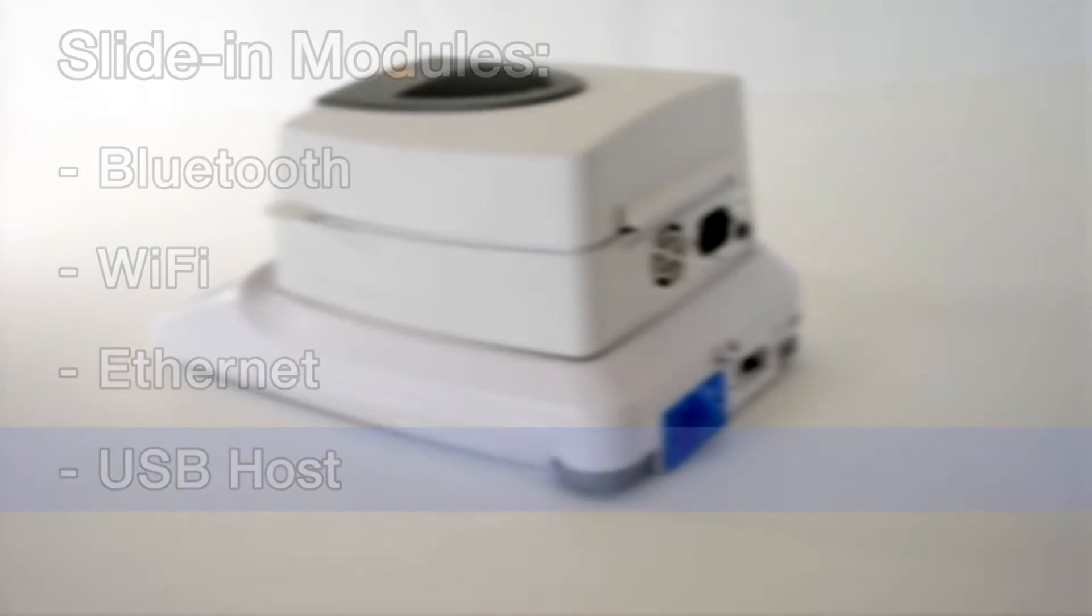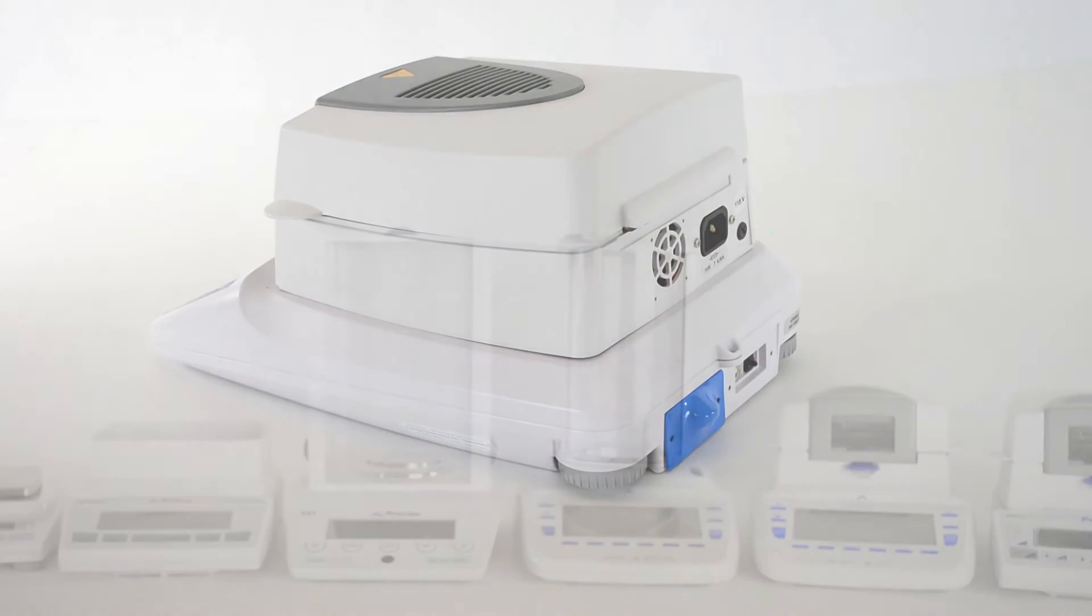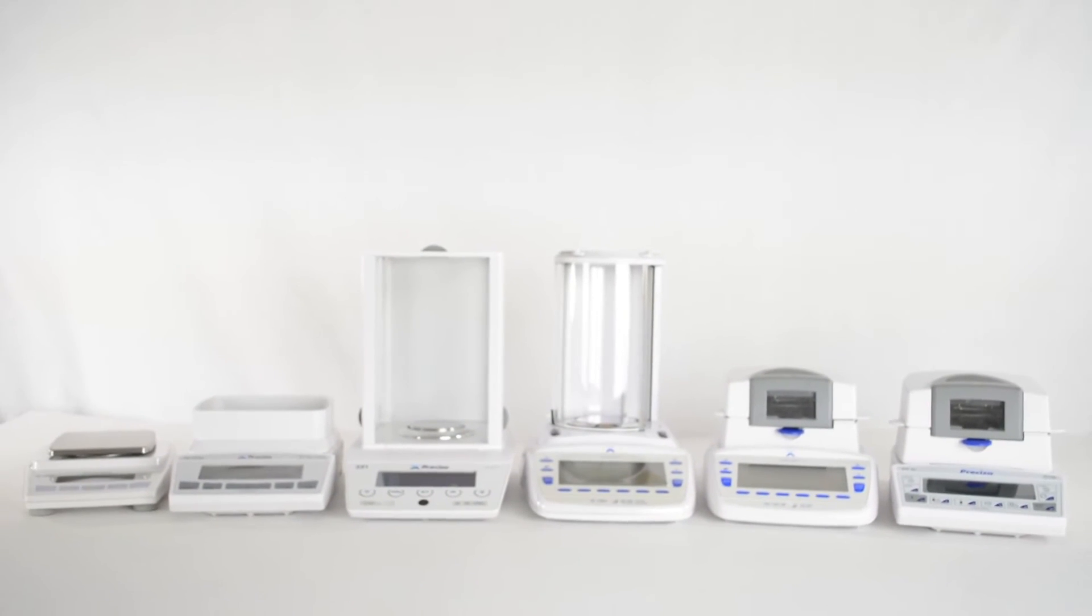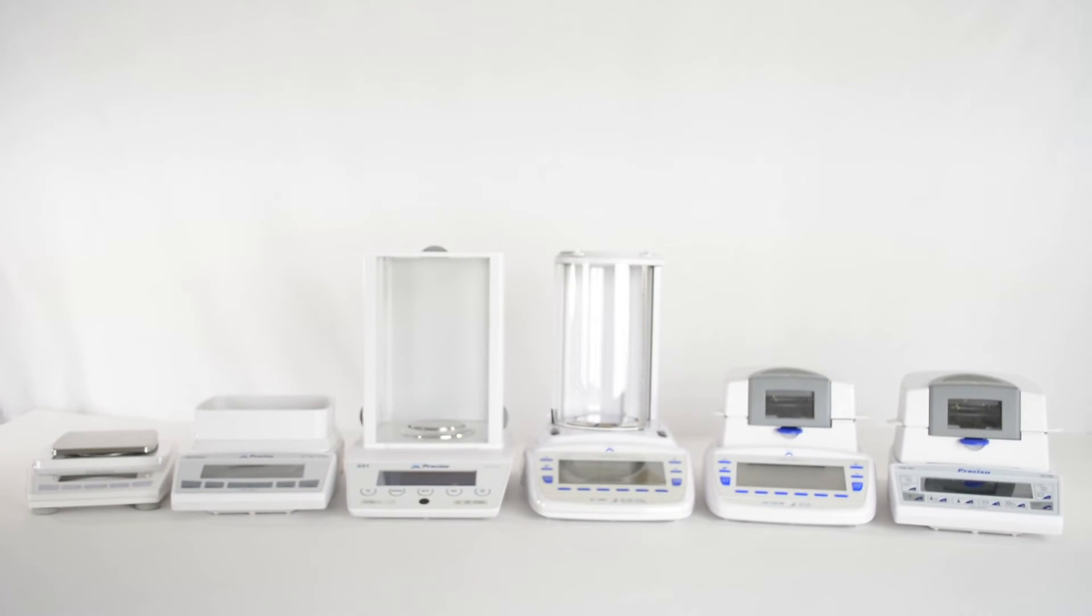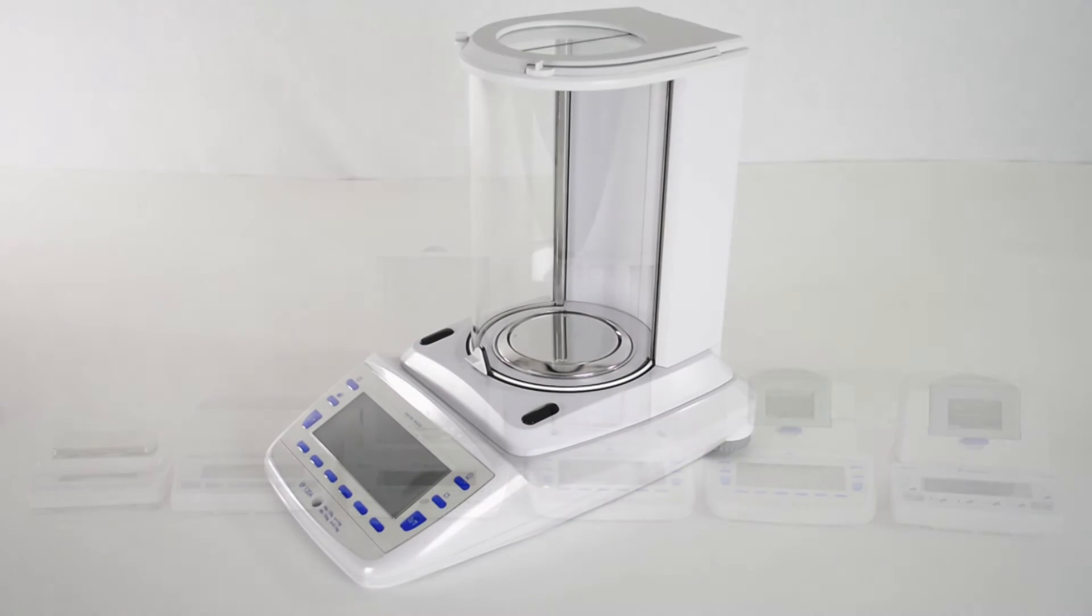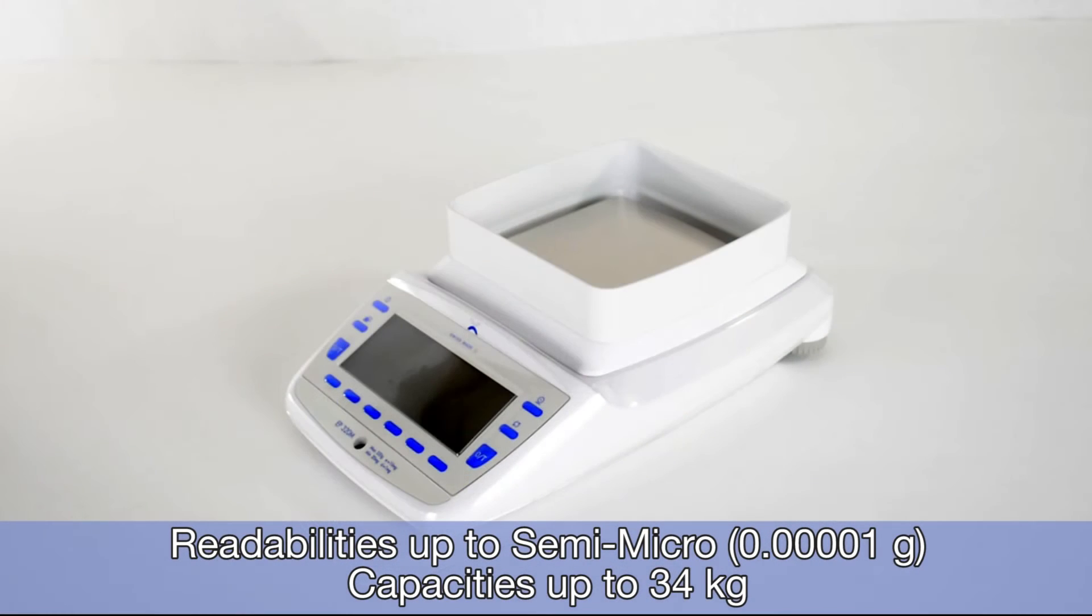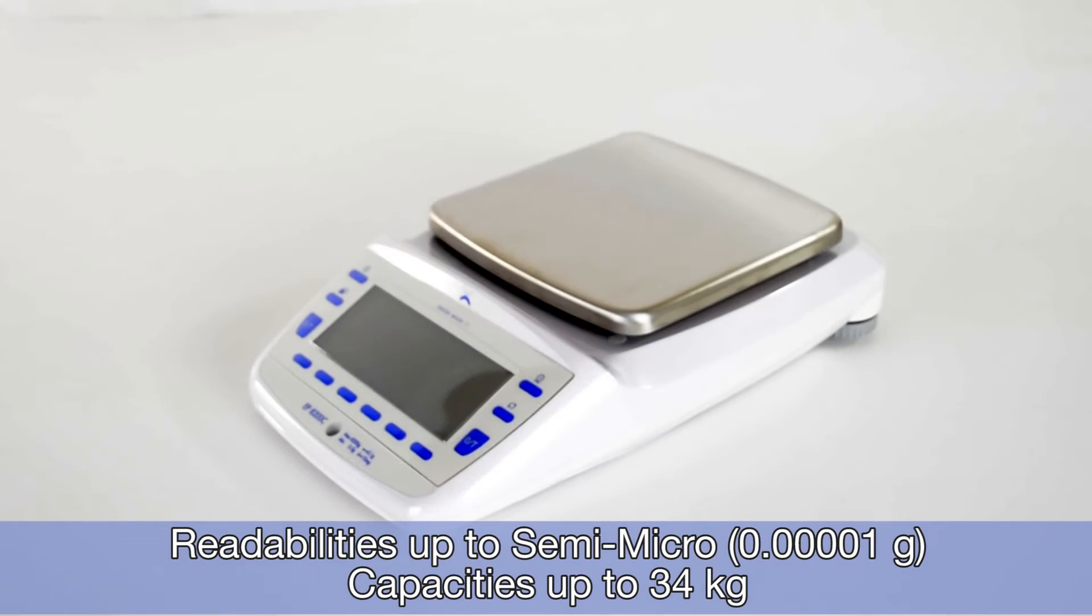The laboratory balance line comes in a variety of capacities and readabilities, including semi-micro, analytical, and top loaders up to 34 kilograms.